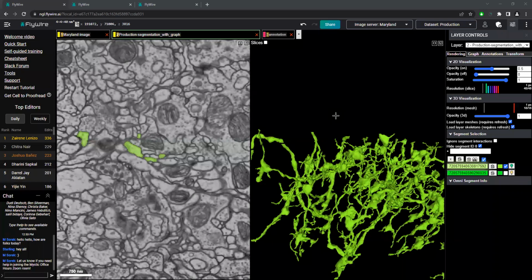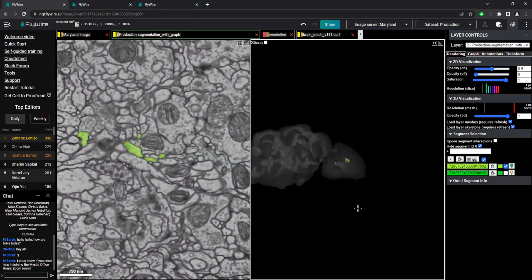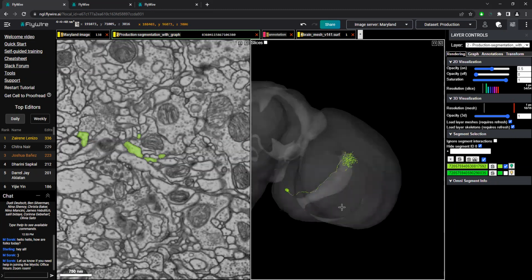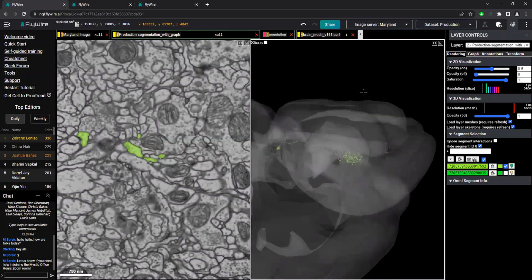And you're definitely going to see that in the optic lobe, by the way, with more misalignments being the issue because of the way that the fly brain was imaged. We'll just look real quick here at the mesh of the fly brain. Since the optic lobes are on the edges of the fly brain, they got a little detached during imaging and then were re-sewn back together digitally. So that's why we have those misalignments or jumps that might be happening, especially between certain areas.